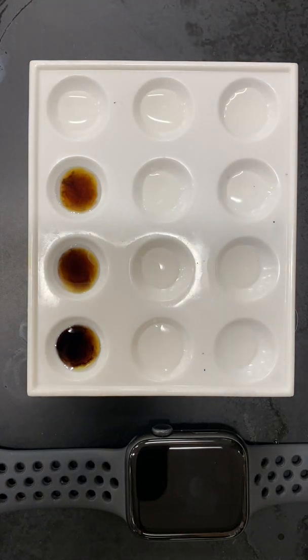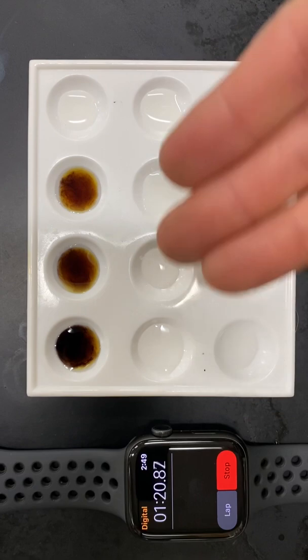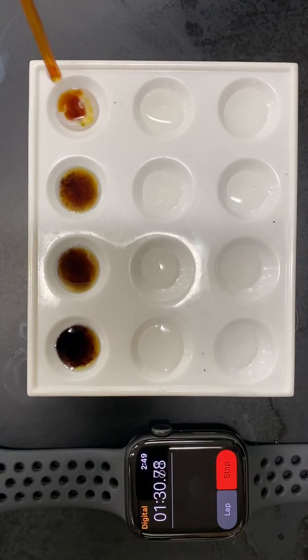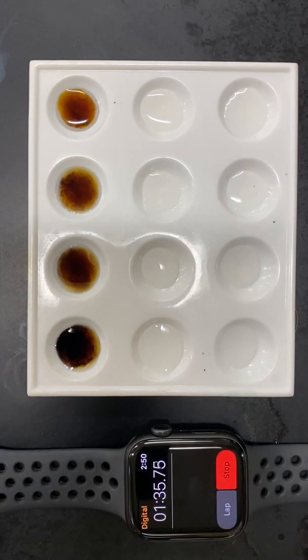And so what we're looking for here is a change in color to go from this black or brownish to turn into a yellow-orange. So here's another drop. It still looks pretty black-brown to me, so we're going to keep going. And we're just going to continue this process until we are all done.